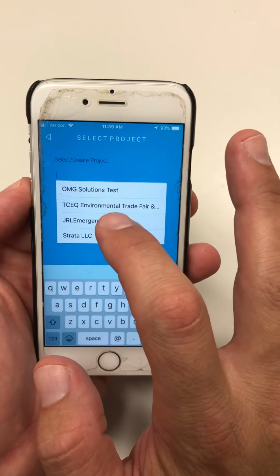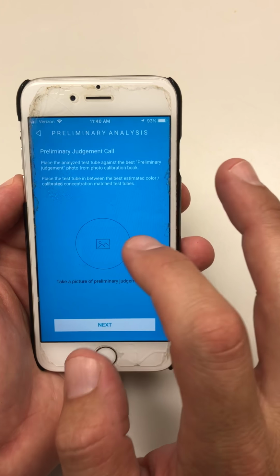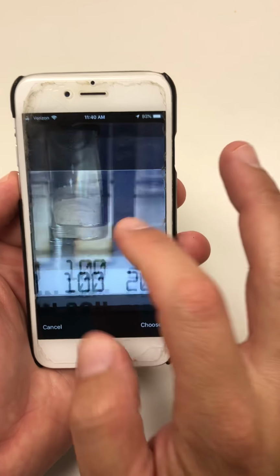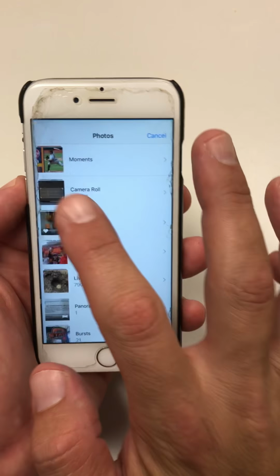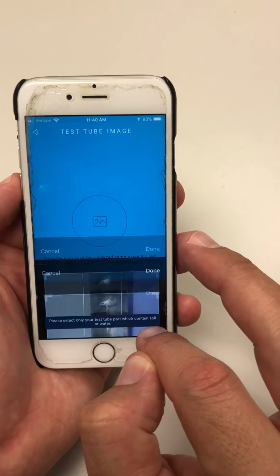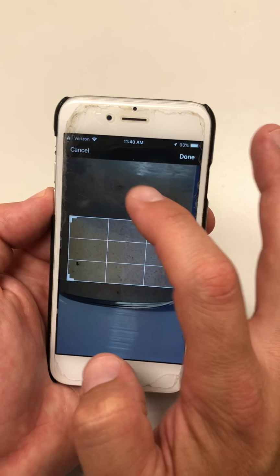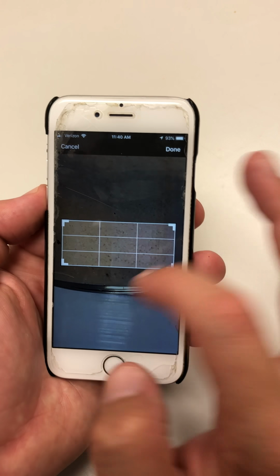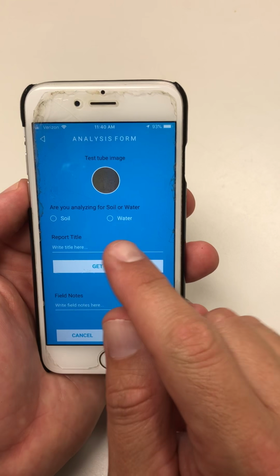Just quickly going back into the mobile application real fast, because I wanted to give you some other hints on the use here. So let's just select some things real fast. Same selections we made earlier. I'll come in here and crop this, why not, just for fun. Remember, that's a good crop there. I wanted to get into this portion of it.